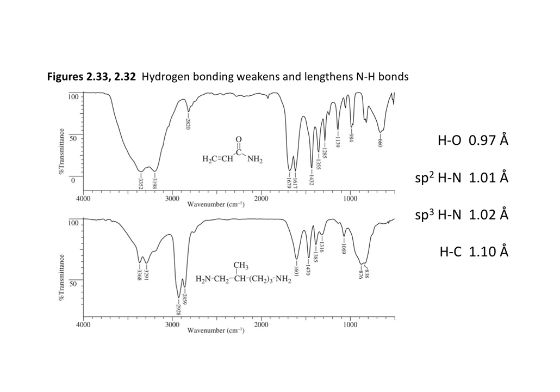For primary amides and primary amines, there are typically two bands. One is an asymmetric stretch for the NH2, the other is a symmetric stretch for NH2. The same for the amine, asymmetric at the higher frequency and symmetric at the lower frequency. Note in the case of the amide, there is also a carbonyl stretch at about 1680 wave numbers, and that will be discussed in a moment.